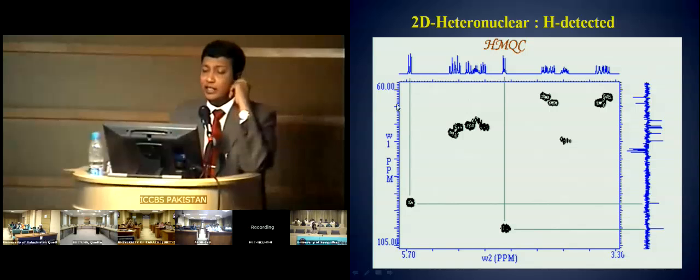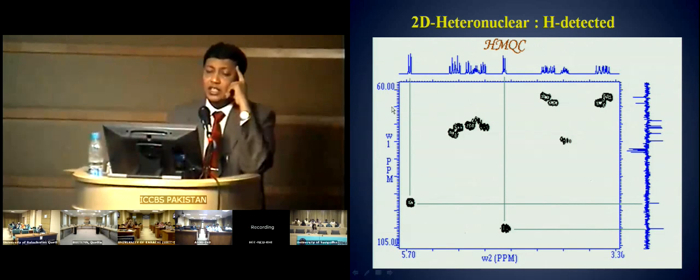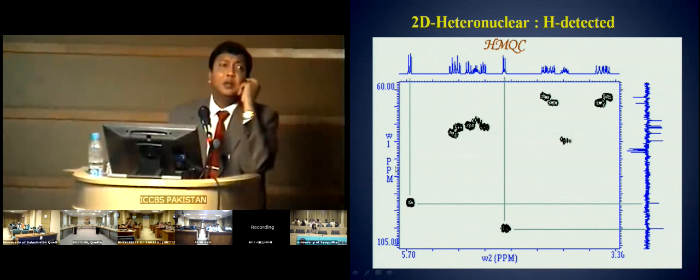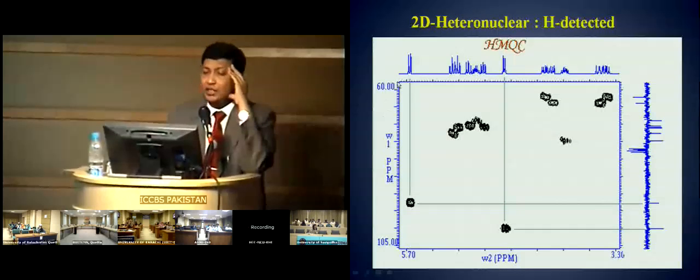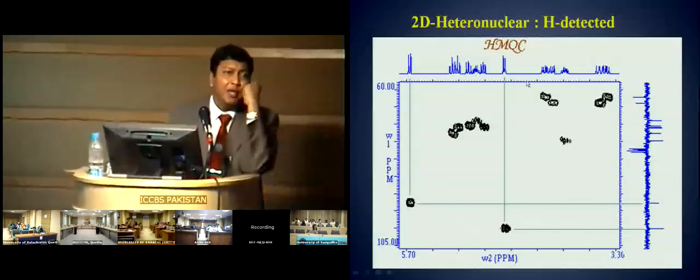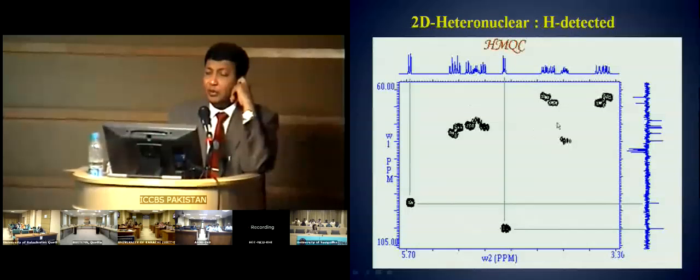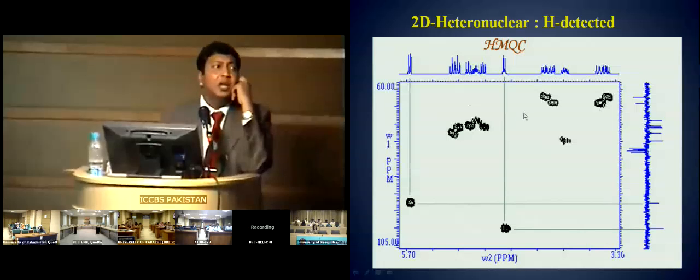The second advantage is that you spread these proton peaks, which are labeled by carbon, on the scale of carbon. Because they are all coupled with it, they would all be spread, and when you spread that you will solve the problem of overlapping. You would be able to identify each proton with reference to coupling carbons, right?